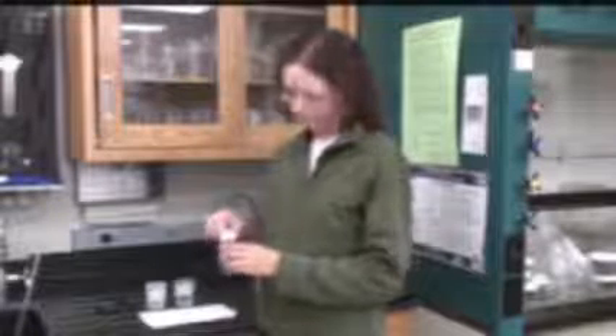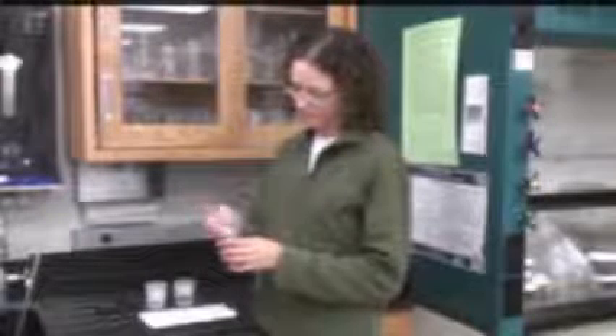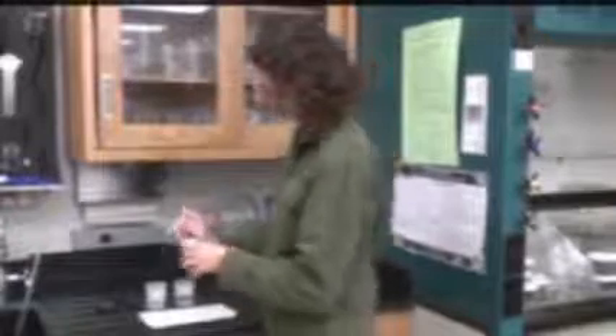In order to run the nitrate-nitrite test strips, remove two strips from the bottle, remembering to check the expiration date on the bottom of the bottle and make sure that your strips are still useful. Close the bottle so the water doesn't get inside on the rest of the test strips.